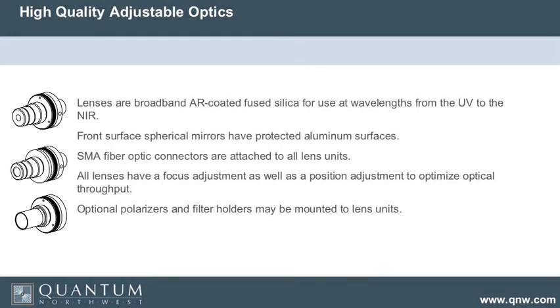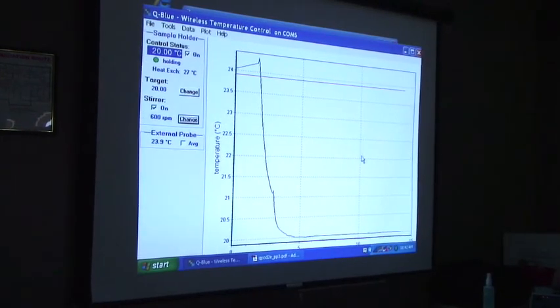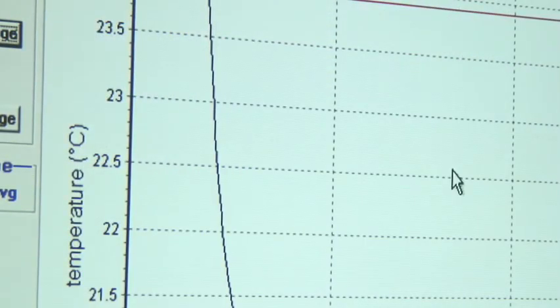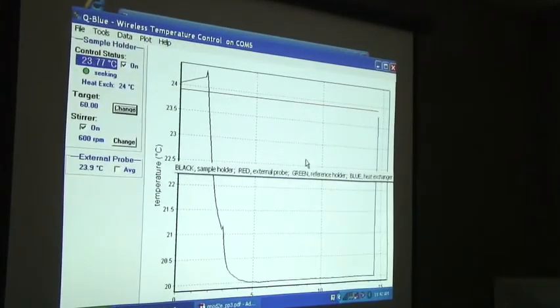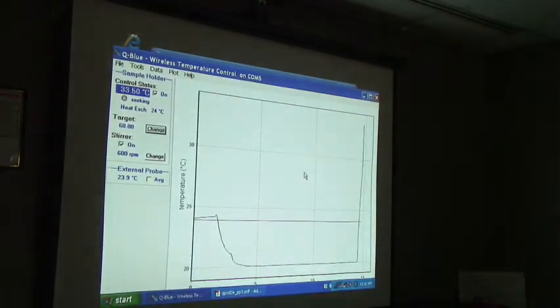There are also optional polarizers, so somebody can set this up as a fairly sophisticated spectrometer. Looking back at the temperature controller — it went down and adjusted to 20 degrees. Let's do something interesting: let's set its temperature to 60 degrees and see how long it takes to get there. Set it to 60 degrees, and you notice it's taking off for 60 degrees. The Peltier temperature control allows you to change the temperature quite rapidly and very precisely — no nonsense control. You can get a lot more experiments done in a much more precise manner.